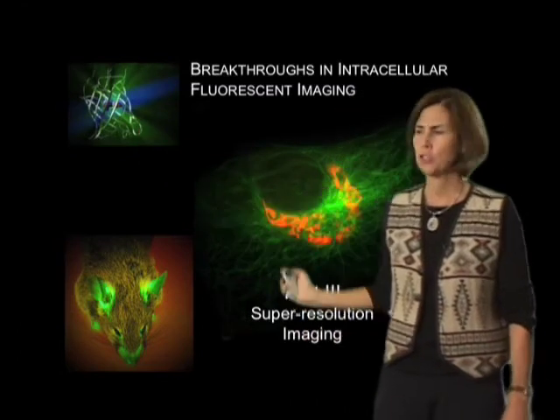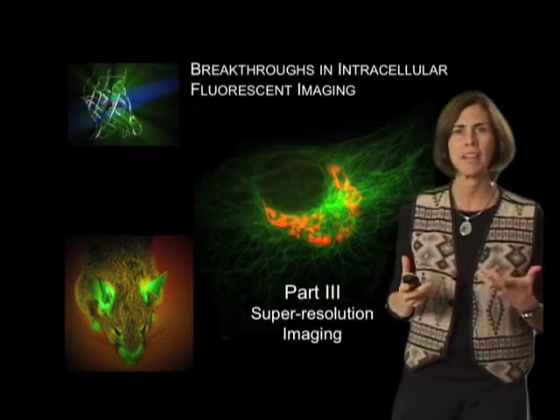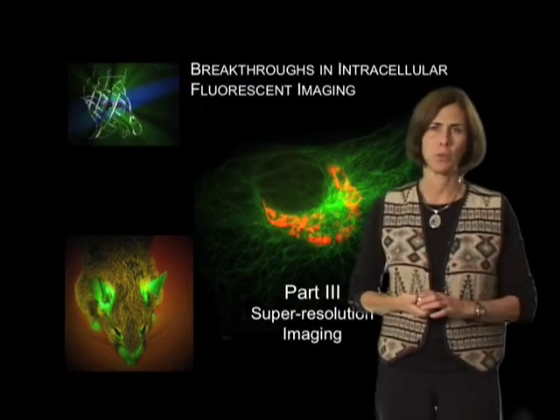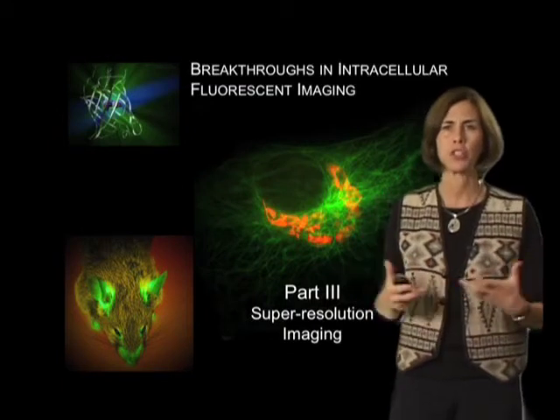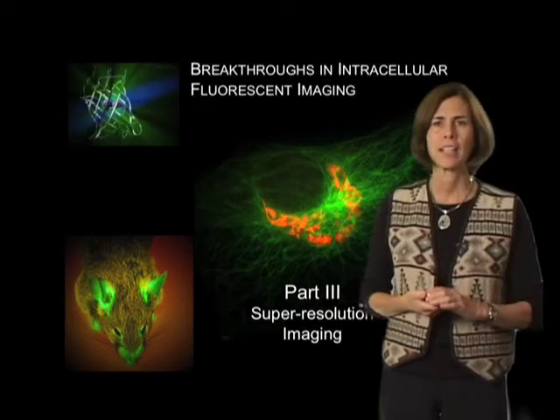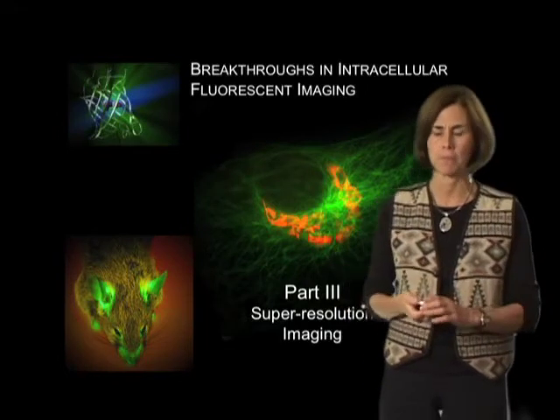This approach, super-resolution imaging, allows us to visualize the behavior of individual molecules, which fluorescent proteins with conventional diffraction-limited imaging cannot allow you to look at. Instead, you're looking at ensembles of proteins.